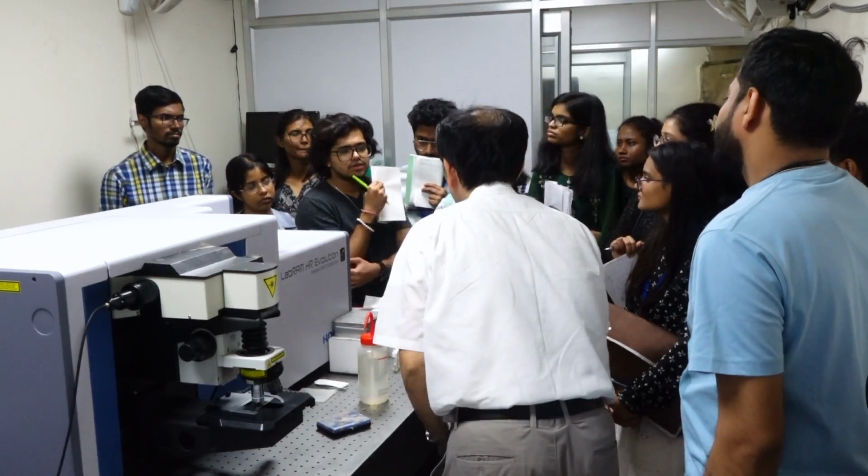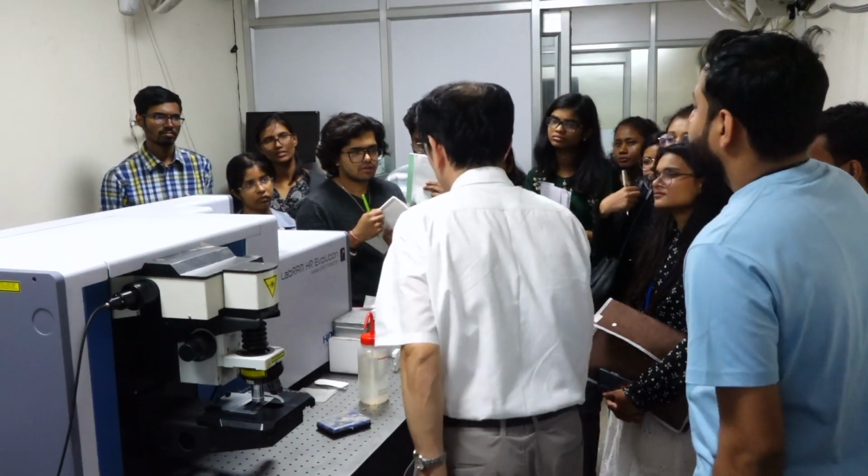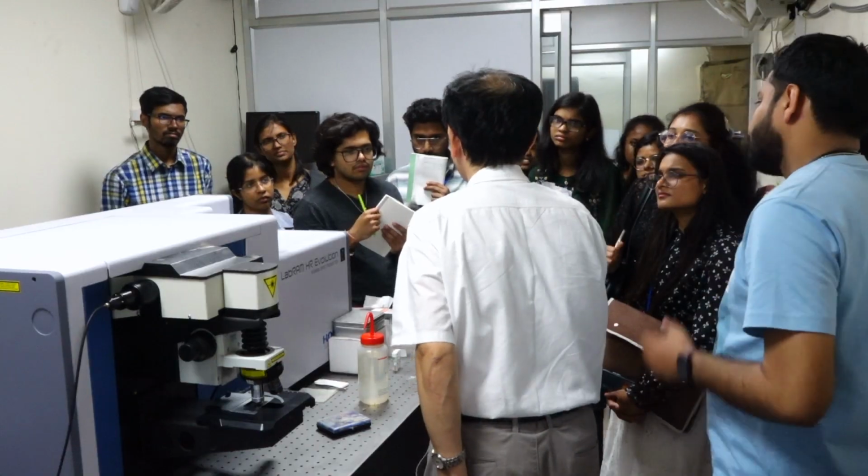What's the full form of CCD? Full form of CCD is charge coupled device.